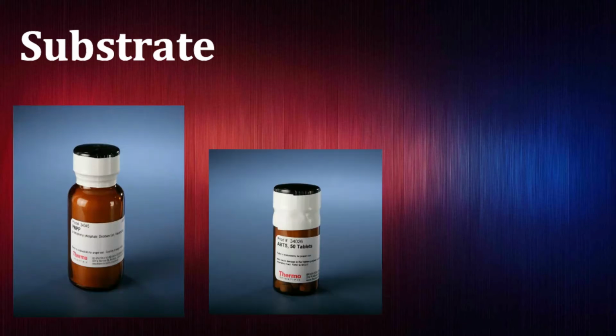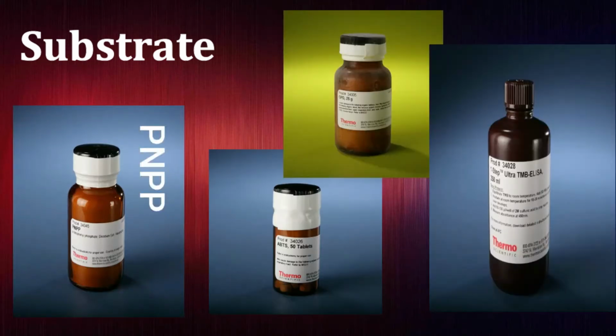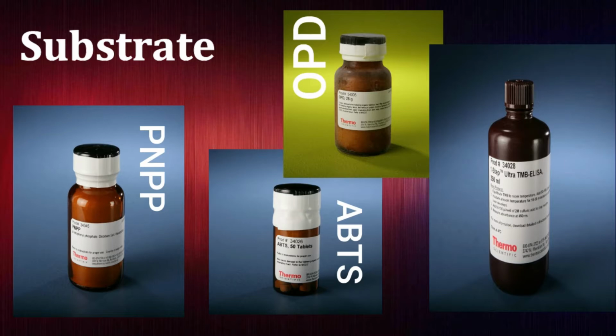Substrate is a compound that undergoes change. Substrate binds to the active sites on the surface of the enzyme and gets converted, with a change of color. Common ELISA substrates are PNPP, ABTS, OPD, and TMB.